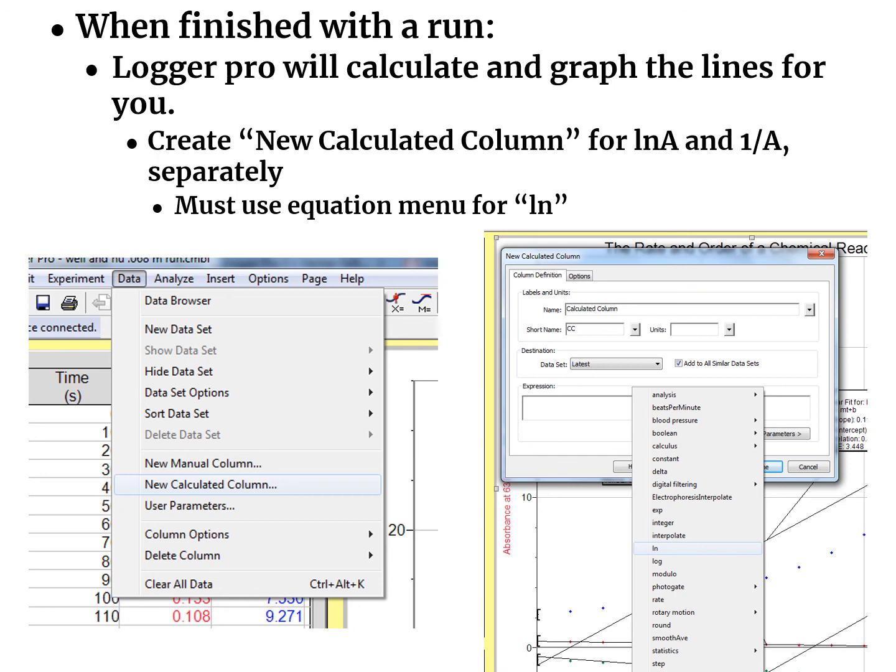So what values will be on your x-axis and what values will be on your y-axis, and then for this new column, you actually just want to input the formulas. And here for the natural log of A, you have to select the ln, and then you highlight the column that already has your absorbance values, and then it will generate all the values for your natural log of A. And then for the column with 1 over A, you just want to follow the same.